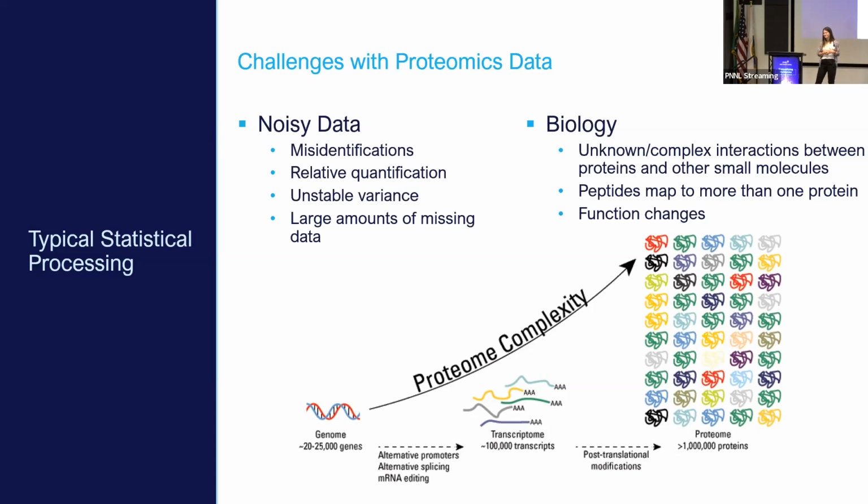Thank you. Are you tired yet? Because we have more. I'll keep them coming. All right. If the experimental design allows, is it fair to say that performing comparison analysis between samples of the same instead of samples across the batches can remove batch effects?